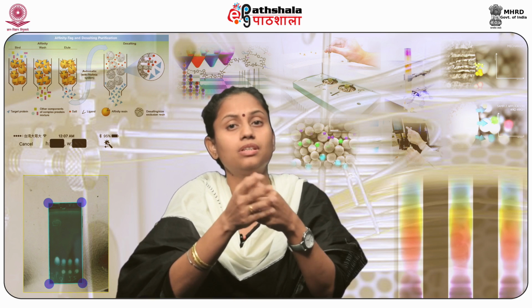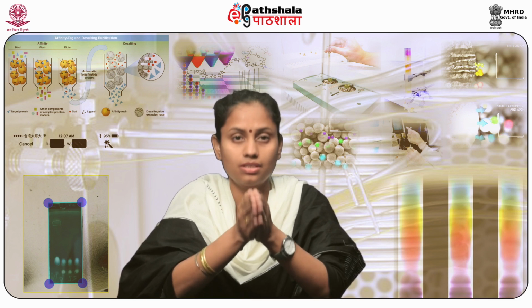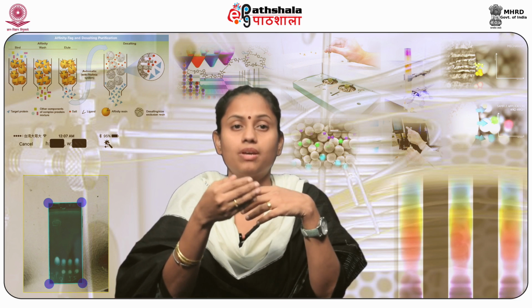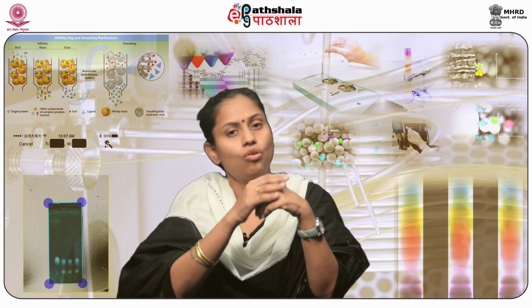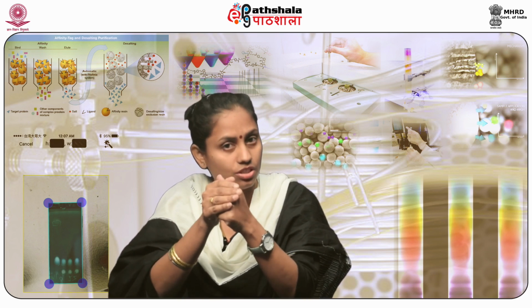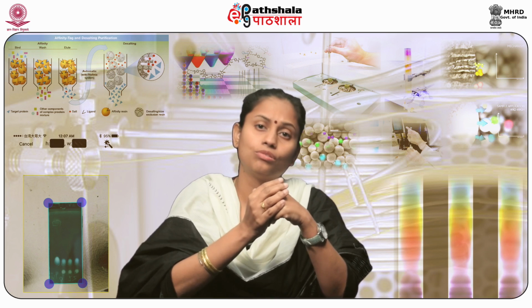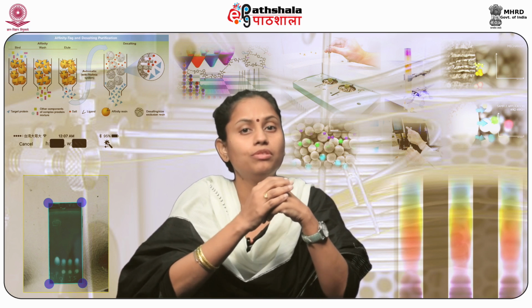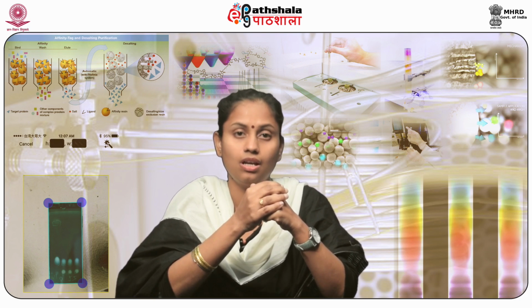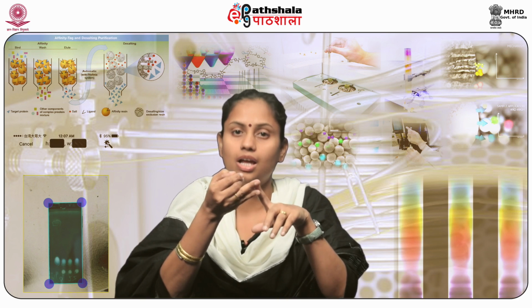After knowing about the different types of stationary phase and mobile phases that are used in ion exchange chromatography, it is very necessary and important to know how to optimize an ion exchange chromatograph. We have already discussed the electrostatic bonding that greatly affects the binding of ions to the stationary phase. Now, we should know how to go about optimizing an ion exchange chromatograph to obtain optimum results. The various factors or substances that play a critical role in carrying out the purification procedure in ion exchange chromatography are pH, buffers, salts, detergents, zwitterions, organic solvents, and temperature.